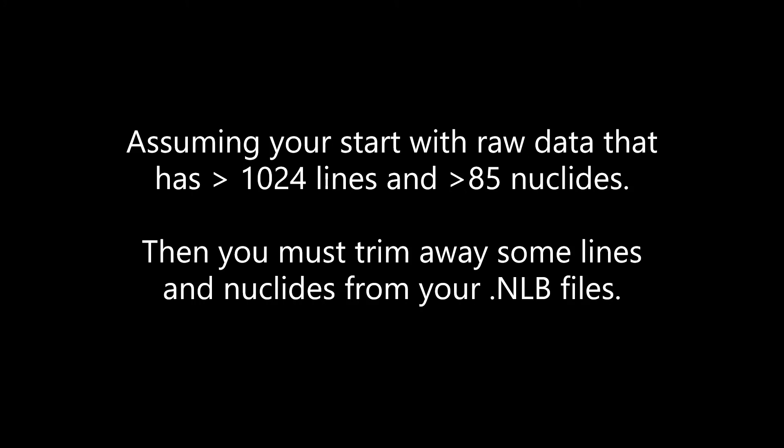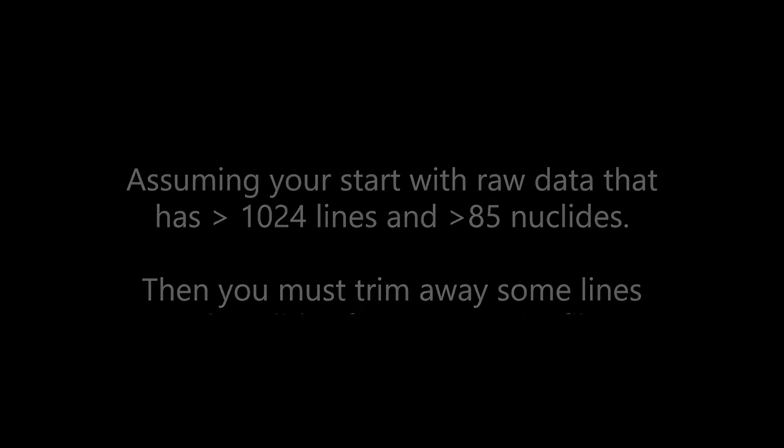To hedge against these error messages, which can render your analysis report useless, I have created an elaborate system that ensures the .NLB files created fall within the size limit that I've set out earlier.